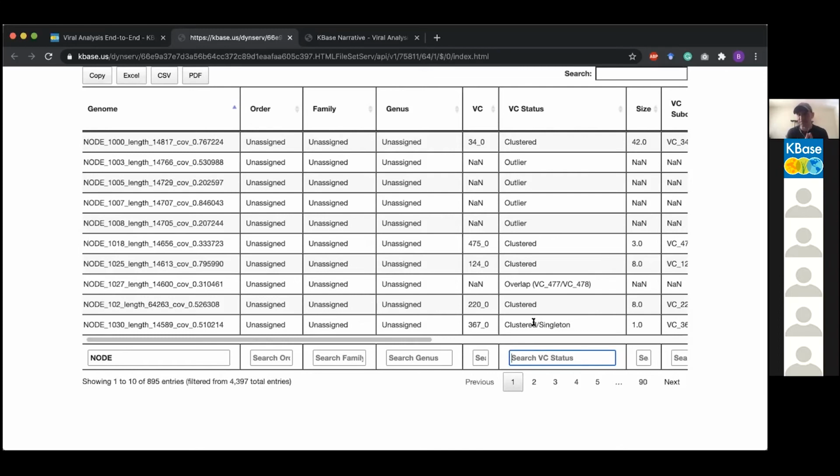So that's what it clustered. You initially clustered, and then you became a singleton because you had no other genera members. You're still part of the same family, but just not part of the same genus. So I would go through.